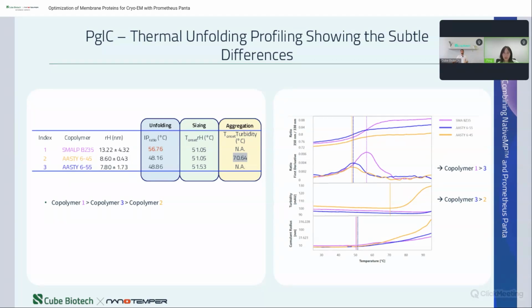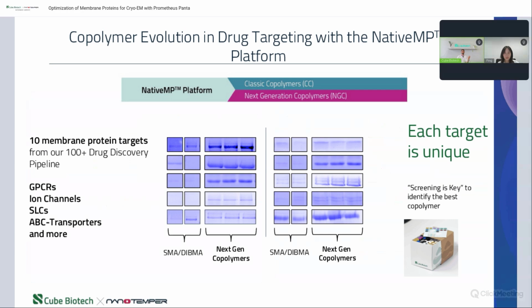Yeah, absolutely, that's cool. So to sum all this up, SMA200 again proved to be a good fit for this target. But the journey to that conclusion always requires a complete picture. And as we've seen in many other cases, I can show you a few examples from our own lab. You can see that it really strongly depends on the target. So maybe for bacterial glycoproteins, SMA200 is amazing, but for many eukaryotic targets, it's not perfect at all.